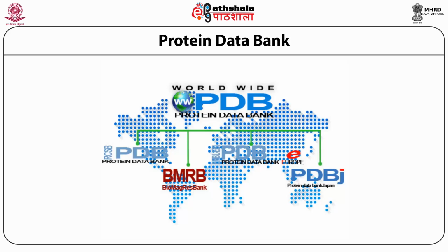BMRB collects NMR data from any experiment and captures assigned chemical shifts, coupling constants, and peak lists for a variety of macromolecules, and it contains derived annotations such as hydrogen exchange rates, pK values, and relaxation parameters. Protein Data Bank Europe contains rich information about all the PDB entries. Multiple search and browsing facilities are also available. The advanced services include PDBe PISA, PDBe Fold, PDBe Motif, advanced visualization and validation of NMR and EM structures. There are also certain tools available for bioinformatics work.